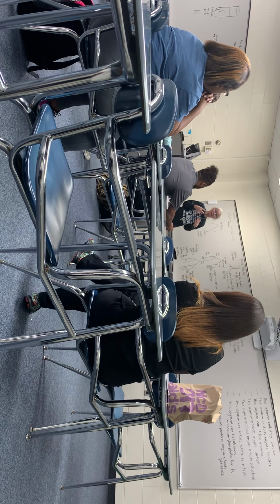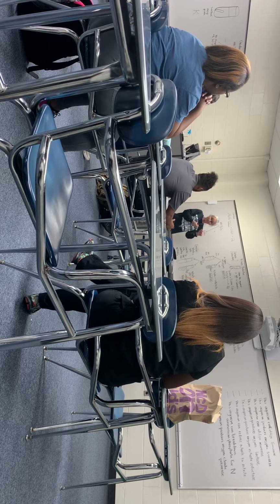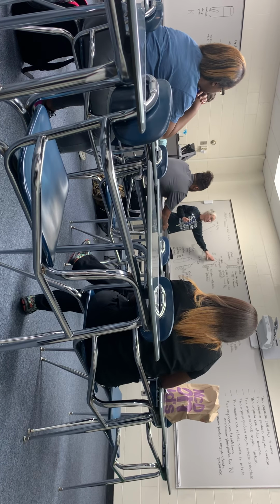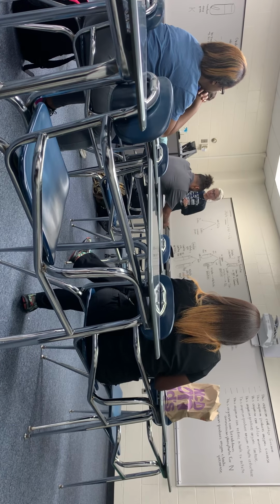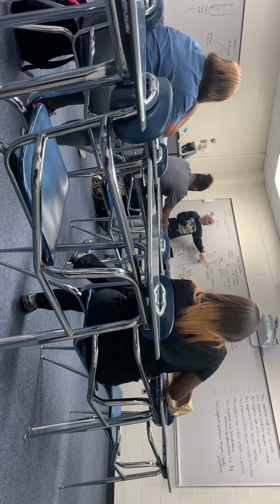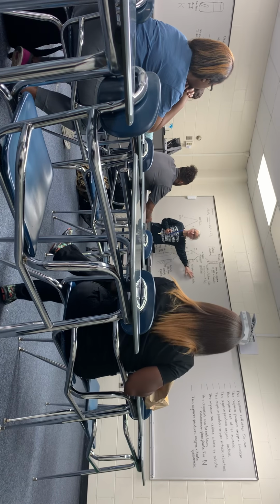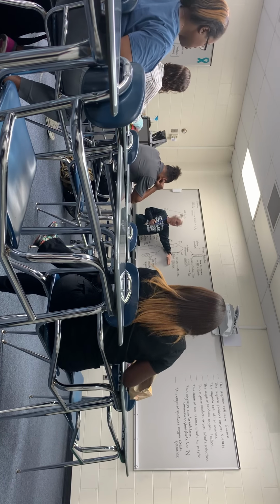So this is where you add the reagents. Remember we had the nitrate A and the nitrate B? We added them right after each other. So if there's no bubble in the Durham's tube, that's when you add the two reagents. The reagents test for the presence of nitrite, okay? So if you add those two reagents and your test tube turns red, that's a positive. So you know the nitrate has been converted into nitrite. Okay, so that's your other positive that can happen.